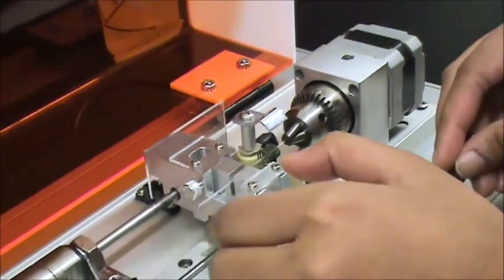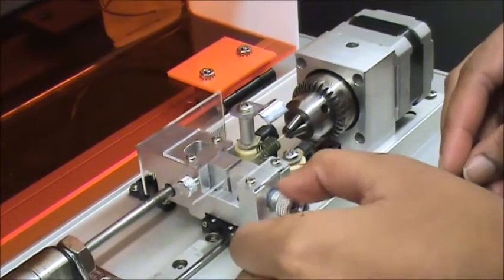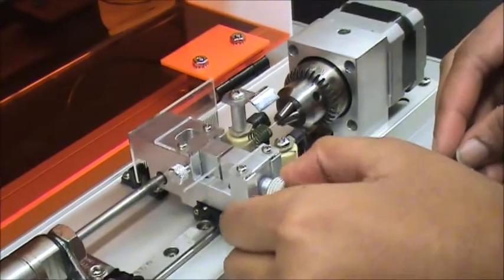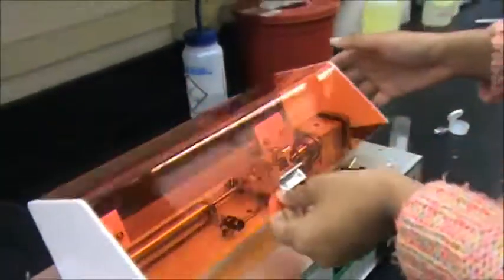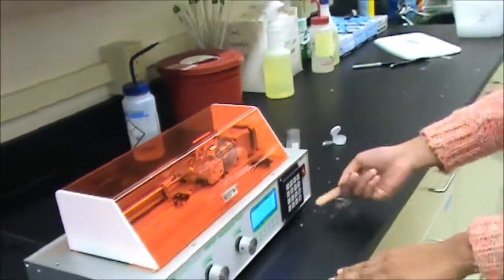We're going to tighten this as well. We're going to push this all the way to the front. We're going to tighten this. And we can put this in here and close it up. Turn it on. And your instructor will help you with this part.